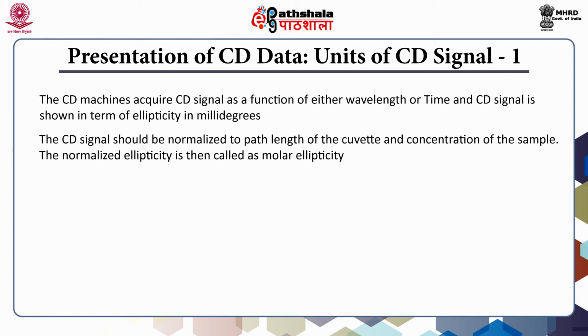The normalized ellipticity is called molar ellipticity, and the normalized rotation is called molar rotation.